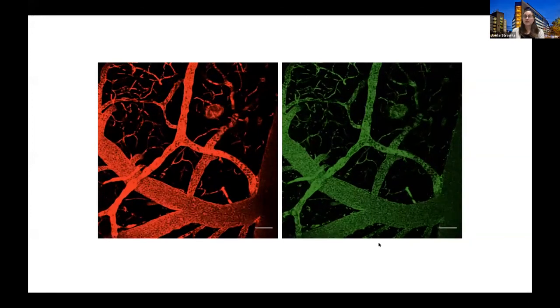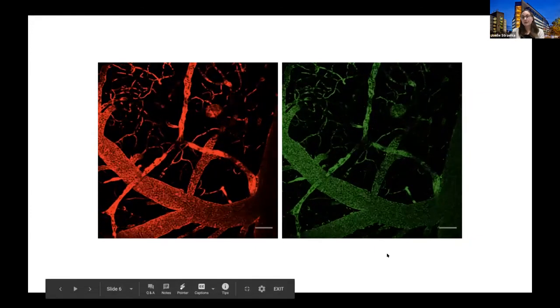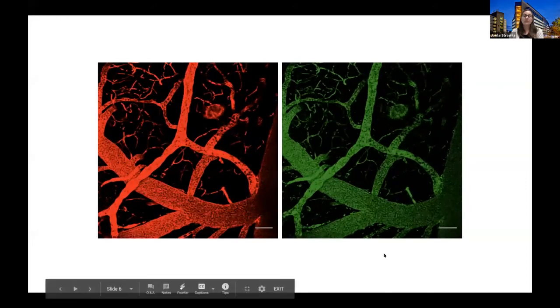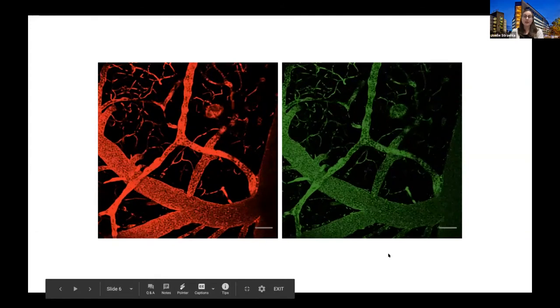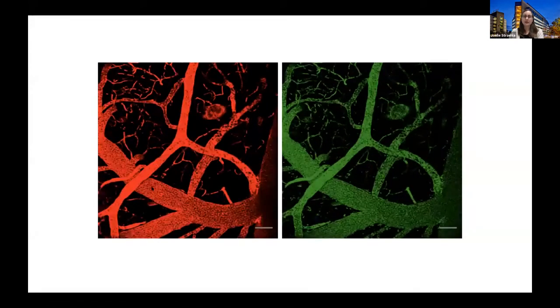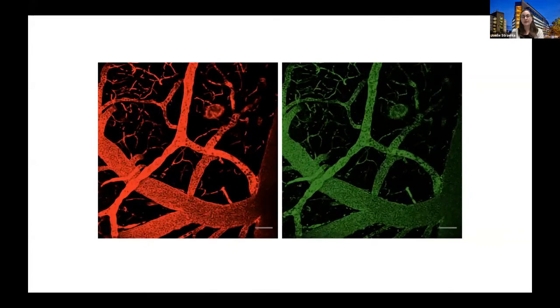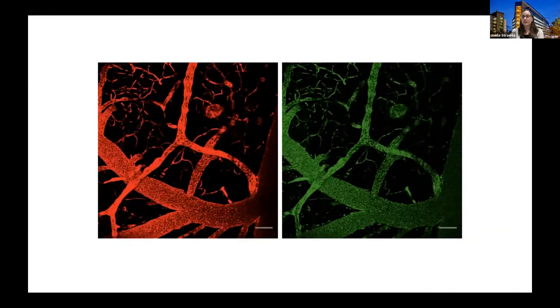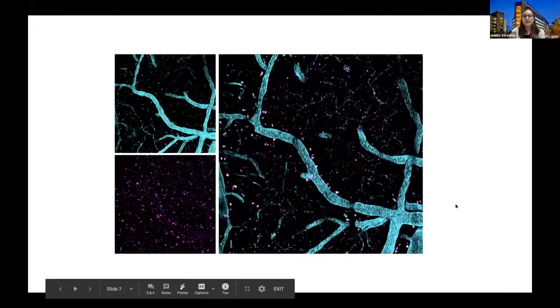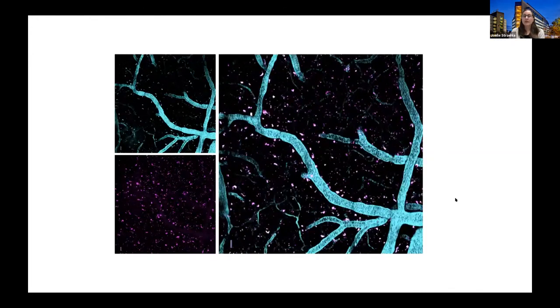And in green over here on the right, you're actually seeing nanoparticles. In this case, they're filling the blood vessels, and some of them are getting out past the blood vessels into the brain tissue. And these little dark dots you're seeing are actually shadows of red blood cells. In some of these very small vessels, you can see that only 1 red blood cell at a time fits. And this is another example of one of the images from the Image Awards panel.